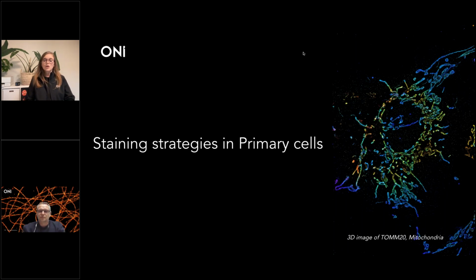And can you comment on what is the better labeling strategy, to use primary labeled antibodies or to use a primary and secondary antibody? That actually will depend on your target, I would say.